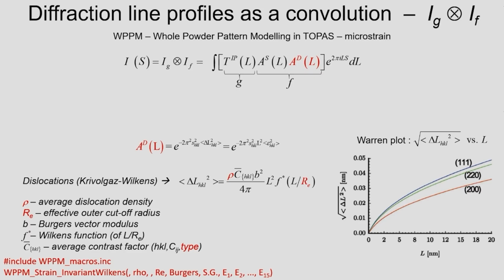But my advice is do not believe in those numbers blindly, because you are sort of overestimating this density, because you assume that all the broadening is due to dislocations. You might have other sources like the grain boundaries or other things. So keep this dislocation density as a sort of upper bound to the real value. And you might even use this theory without dislocations at all, because in the end you have to fit the data. So if the model works, you can make a sort of effective use of it.